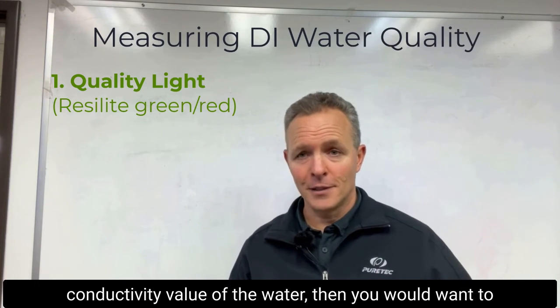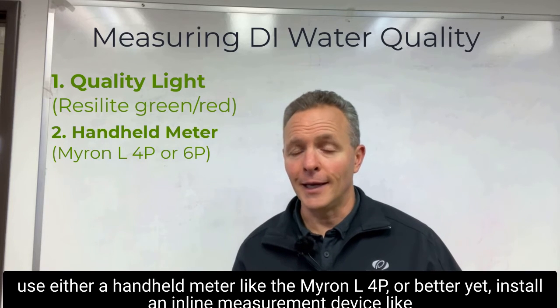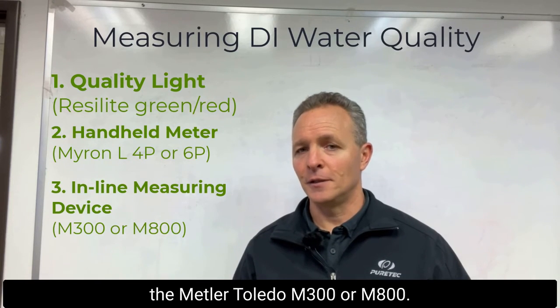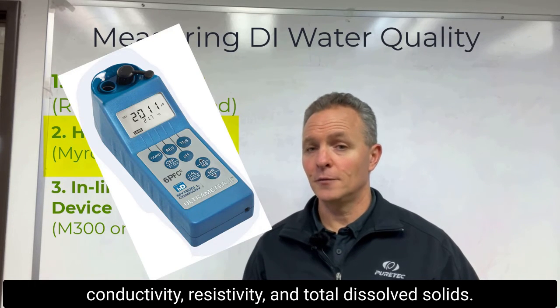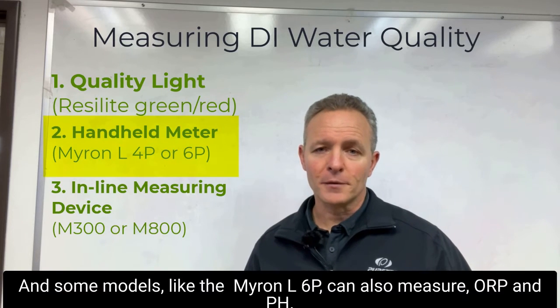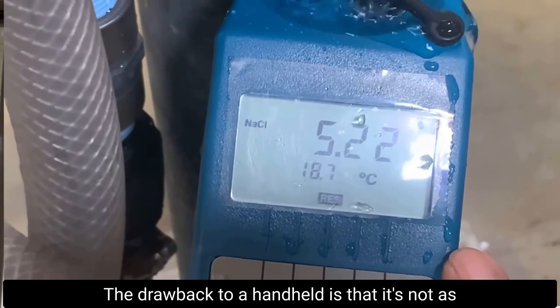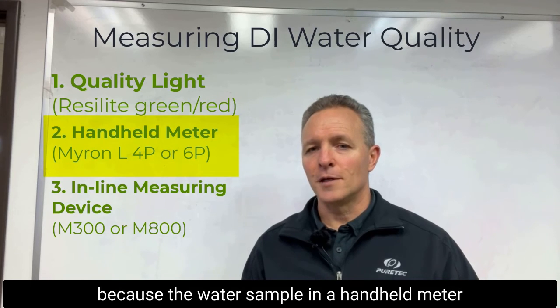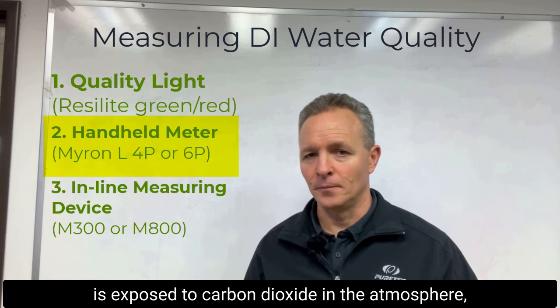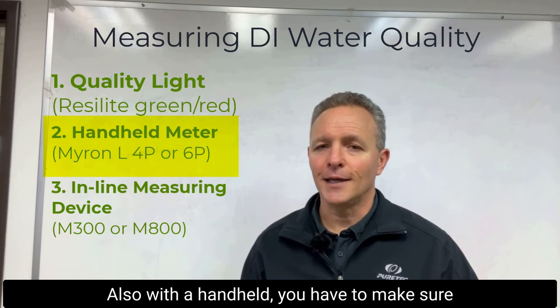If you need to know the exact resistivity or conductivity value, you would want to use either a handheld meter like the Myron L 4P, or better yet install an inline measurement device like the Mettler Toledo M300 or M800. A handheld is nice because it's portable, easy to use, and can give you readings in conductivity, resistivity, and total dissolved solids. Some models like the Myron L 6P can also measure ORP and pH. The drawback is that it's not as accurate as an inline device, especially at higher resistivity values, because the water sample is exposed to carbon dioxide in the atmosphere which converts to carbonic acid, which is conductive and will result in a false reading.